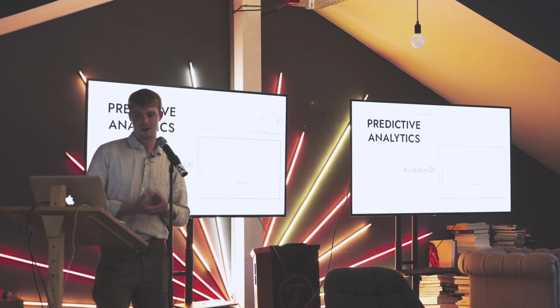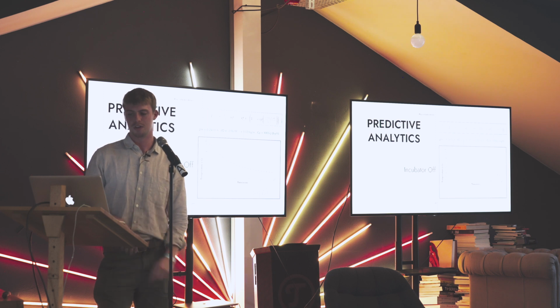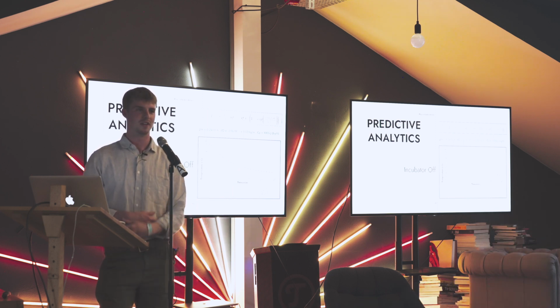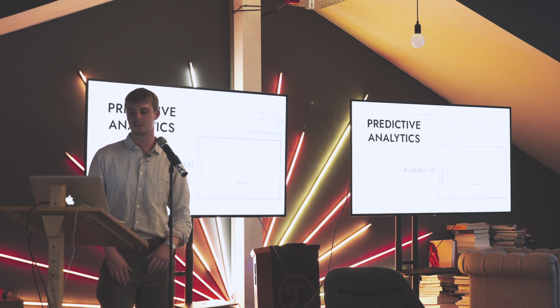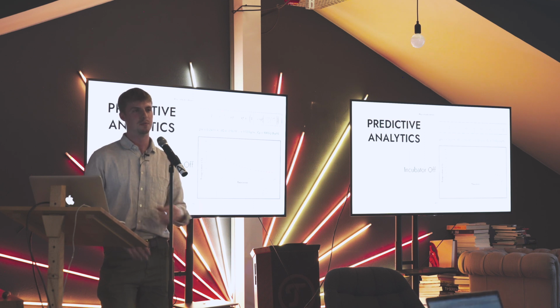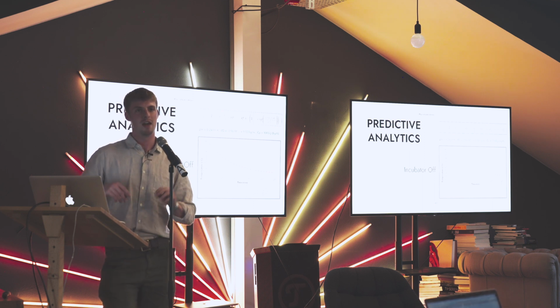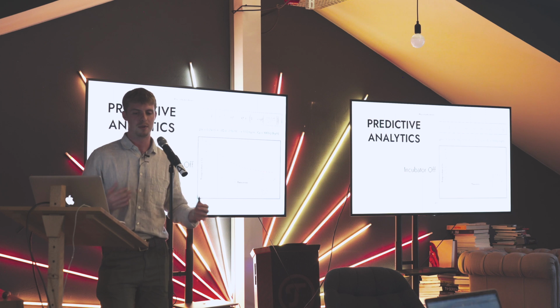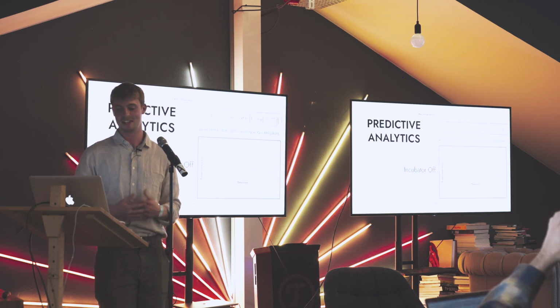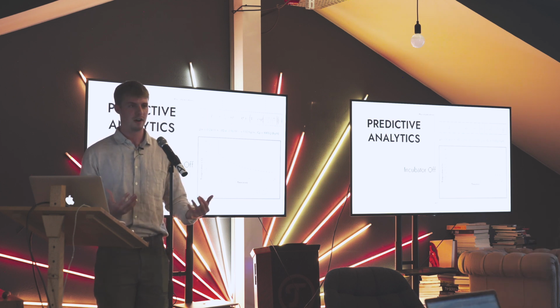And imagine if not only for temperature you could do this, but with pressure, light, gas, motion, sound, conductivity. There are so many open source small electrical engineering components that are super cheap out there. If you could tap into every single different part of a laboratory, you'd be able to extract so much data out of it that could really give a life scientist's life a much easier time and reduce variabilities in general.